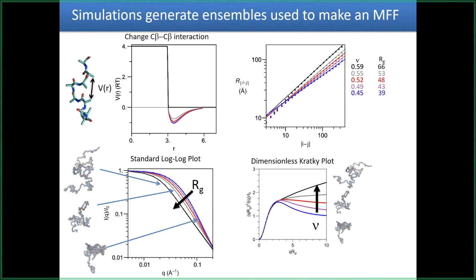It works better than I think. Empirically, people have been able to apply it fairly well with 60 amino acids. Somebody has to work at 40. The way I'd test that is to fit it out to one regime and see how well it extrapolates out to there. You appreciate that we're really doing an overall scale factor to get the I0 right. Then we have the width, and then we have the nu. So I think you want to call it three or two parameters; I'm not going to argue how many. But if I fit it only out to here, and then the data points extrapolate out, I'm pretty confident that we got it right. Because if hydration were an issue, there's no reason why it should fit that well that far out.